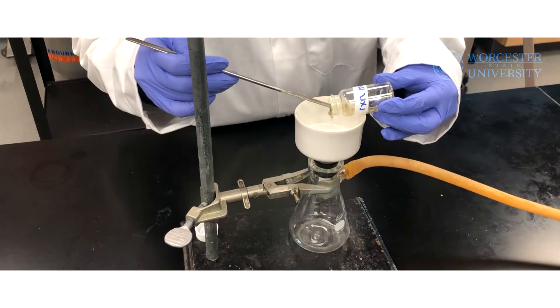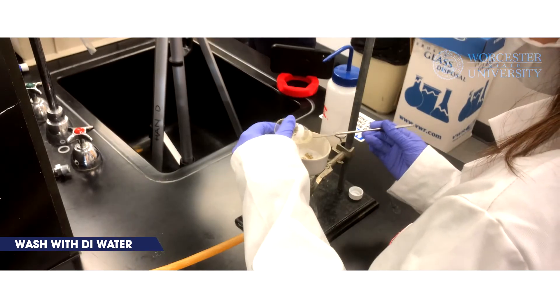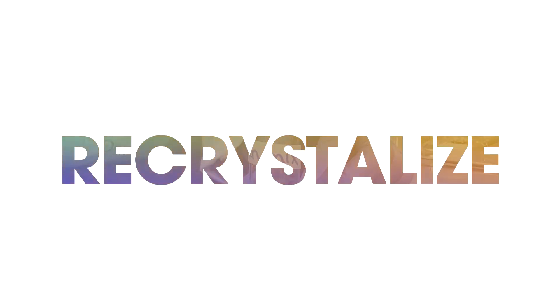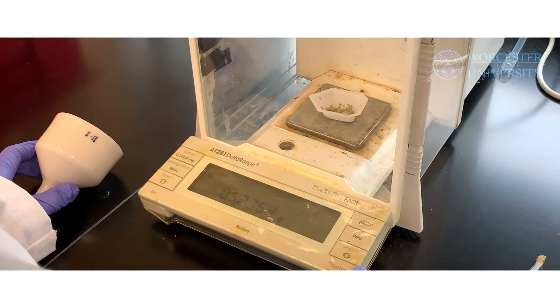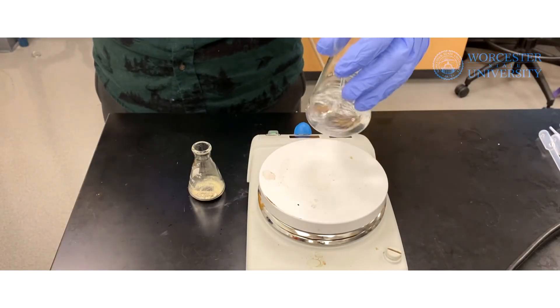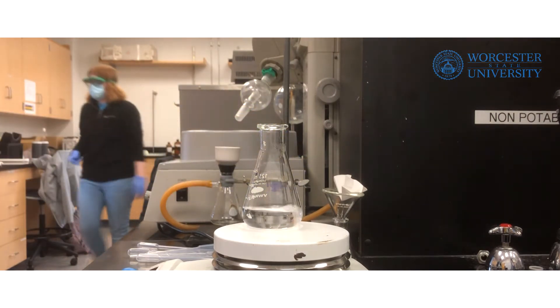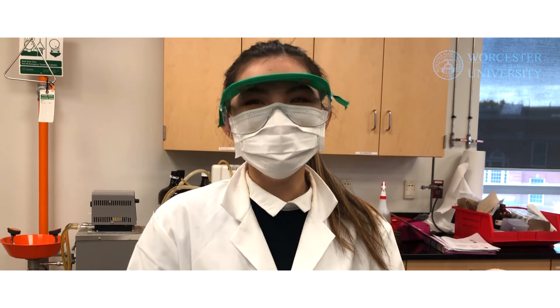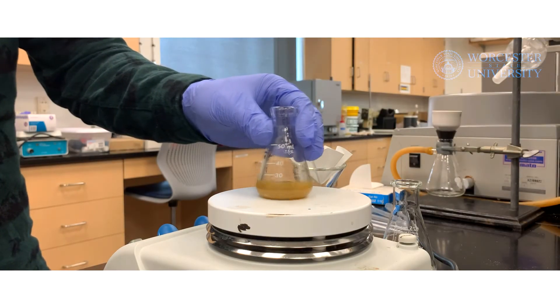Collect the crude product via vacuum filtration in preparation for recrystallization. First, weigh the crude product. Transfer the crude product into an Erlenmeyer flask and heat your 9-to-1 ethanol-water solvent in a separate Erlenmeyer flask equipped with a boiling chip on a heating mantle. It is important to use an Erlenmeyer flask as its small neck reduces the amount of solvent evaporated into the air. When the solvent is almost boiling, transfer a minimum of hot solvent into the flask with the crude product and mix to dissolve as much solid as possible.